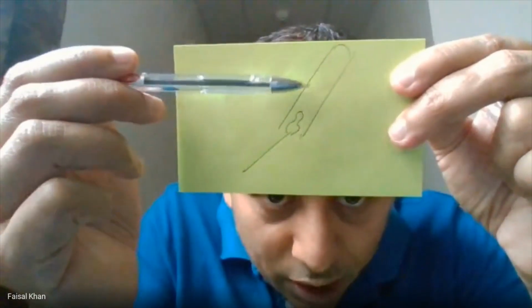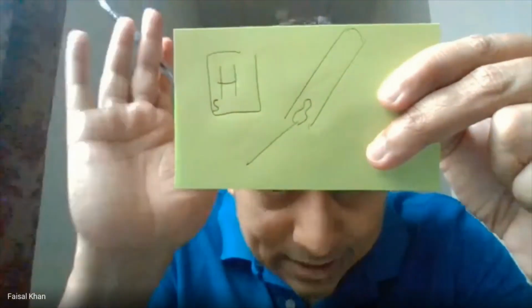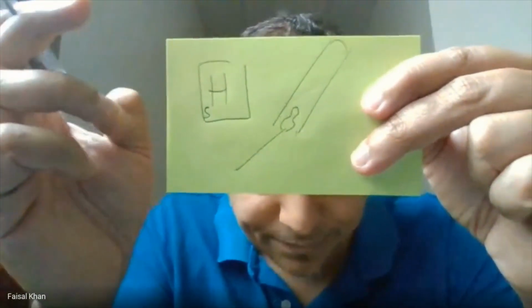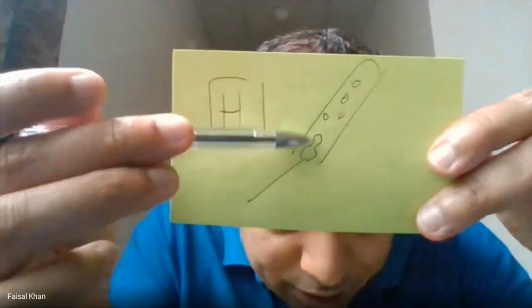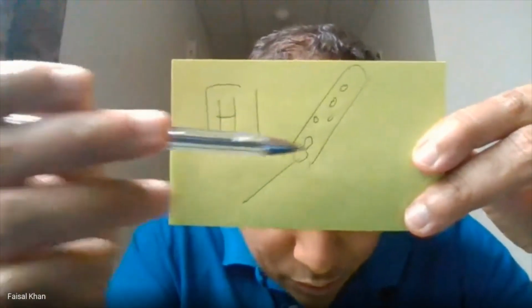So this would be for hydrogen, okay? And what you would have is a lighted splint. So that would be the chemical test. And then what you would expect is colorless water droplets forming on the inside of the test tube because it's a combustion reaction, so the hydrogen forms water.